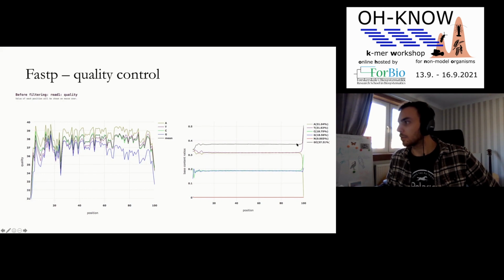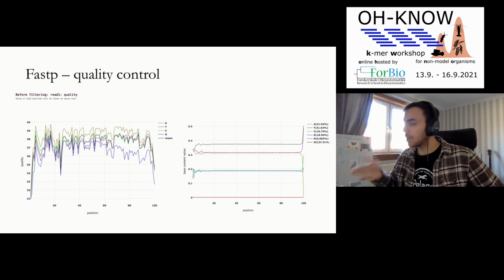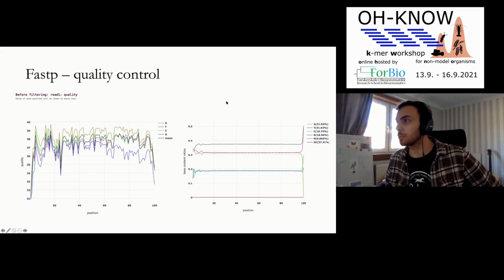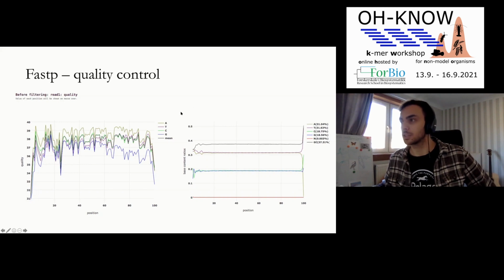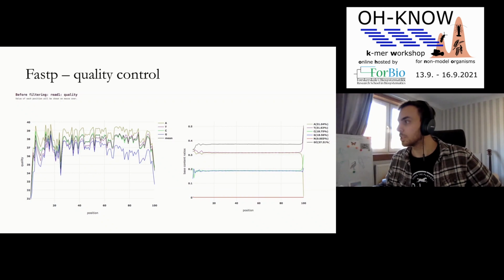And what you'll see if your data is highly affected is that this G, the blue line in this case, will actually just start spiking massively. That might tell you that you need to trim off those poly-G tails. Fastp will actually tell you if that's a problem, and it will detect if your data was collected with NovaSeq. And there are settings to remove those poly-G tails.